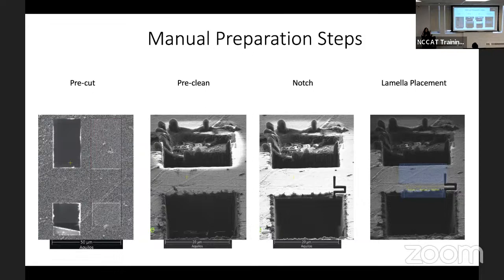So for a nominal thickness in AutoTEM being 100 nanometers, I normally do 2 minutes and 55 seconds of GIS on top, and then I will just step down depending if people want thicker lamellae or not. So for 140, I might do like 2 minutes and 45 seconds instead. And that seems to be good enough to just leave a little strip of GIS and not completely destroy your sample.